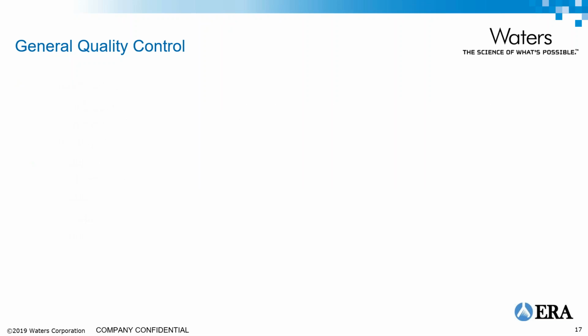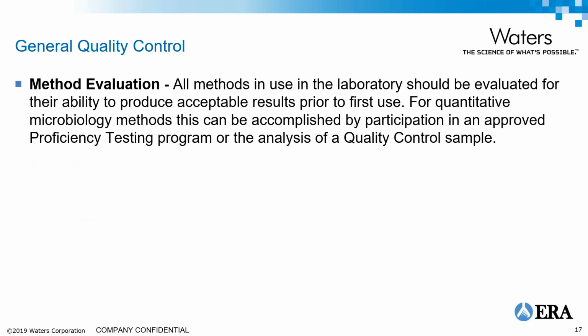So let's talk about method evaluation. You should demonstrate that all methods that are in use in the laboratory are evaluated for their ability to produce acceptable results before they're first used. For quantitative micro methods, you can accomplish this by either participating in a PT program or getting a quality control sample.